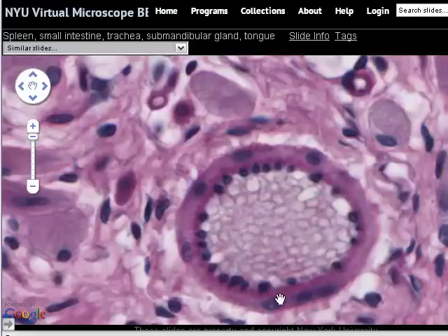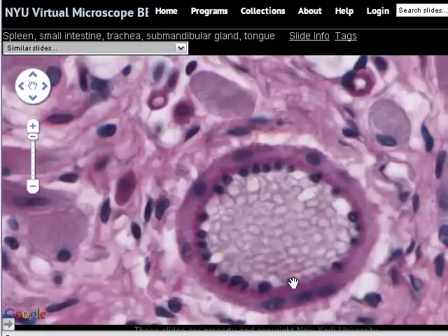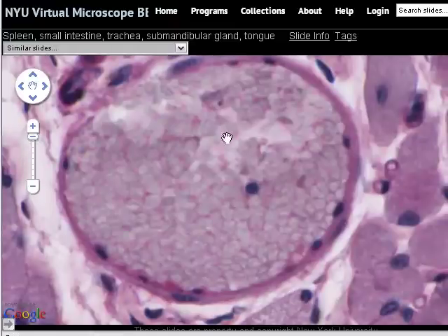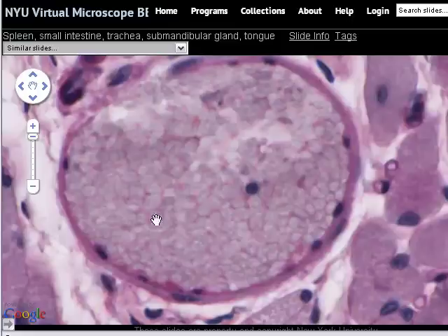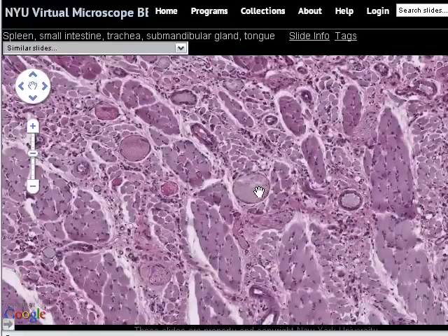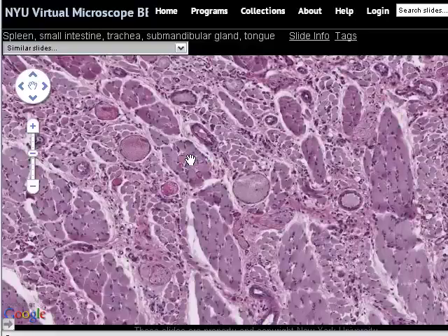As a consequence of contraction, the nuclei of the squamous endothelial cells bulge into the lumen of the vessel. Although we can't see endothelial cell cytoplasm, we can see the nuclei of squamous endothelial cells forming the lining of the blood vessel. Moving across to the venule — venules at this size don't have any real muscle associated with their wall; the lumen is filled with red blood cells. Here's a squamous endothelial cell, squamous endothelial cell, squamous endothelial cell. This is a good place to look if you want to see squamous endothelial cells lining blood vessels.